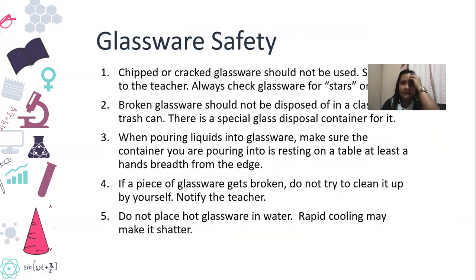Now another set of rules, but this is specific for glassware. Glassware meaning your test tubes, your beakers, your flasks, your pipettes. So let's just go through the guidelines. I think there are only five.